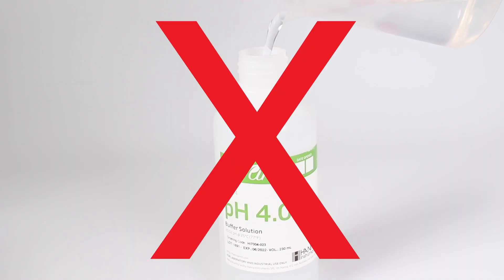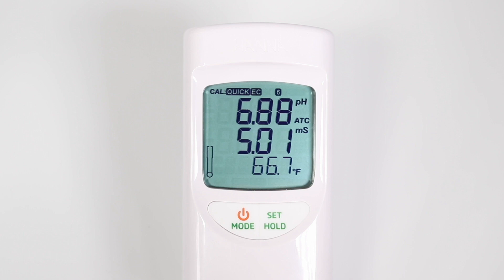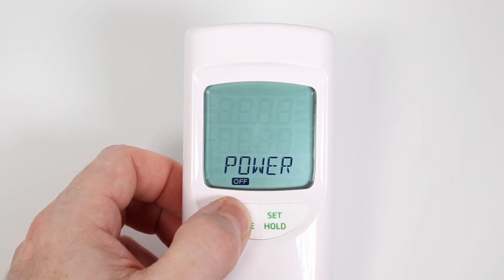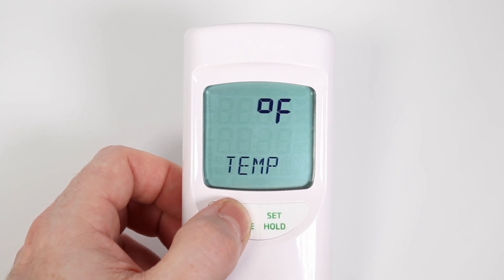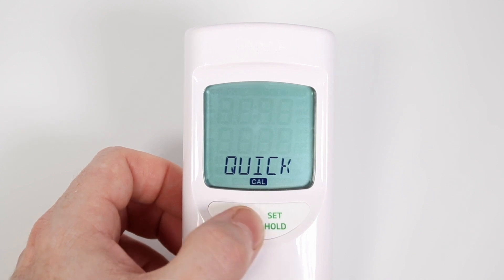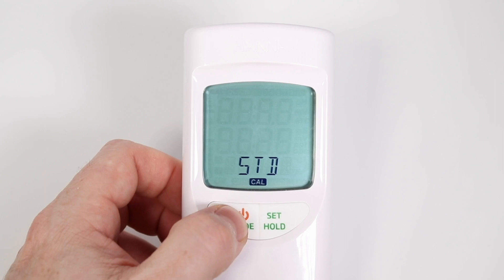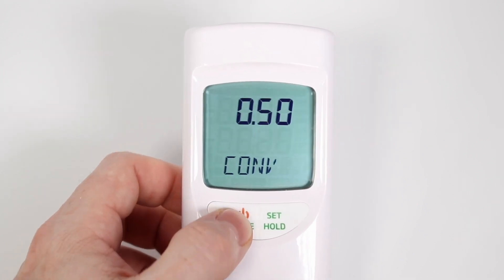Do not pour used calibration solution back into the bottle. To calibrate your meter using Hanna or any brand of pH 4 and pH 7 calibration solutions, you must first enter the options menu and switch to cal standard mode. Press and hold the mode/power button until setup appears on the screen. Press mode until quick cal is displayed, then press set to change it to standard cal mode. Press mode four times to bring back the measurement screen.